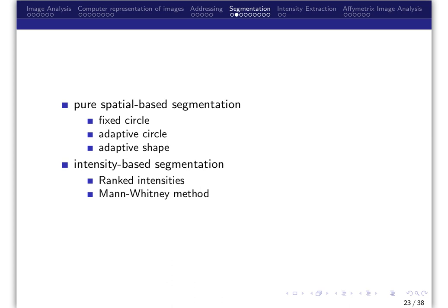Statistically based segmentation methods also exist and include ranked intensities and a method based on the Mann-Whitney U-test, also known as the Wilcoxon rank sum test.